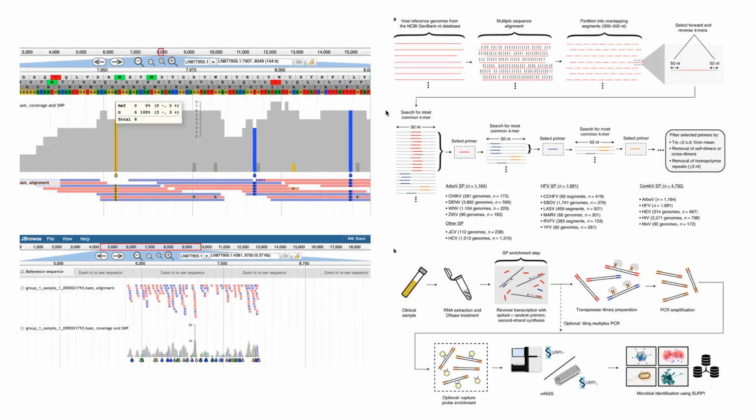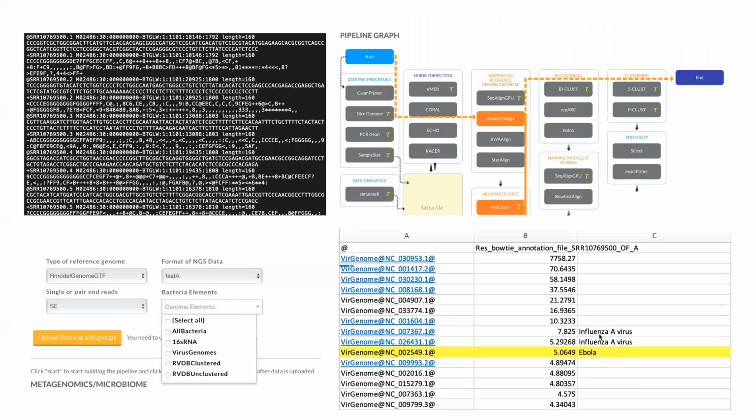Okay, and here's just a description of how that protocol for amplification of different types of viruses works. It's actually not designed specifically for Ebola. It was designed for 16 different viruses, including influenza, Ebola, and other viruses. And so that's why you see others present here as well.